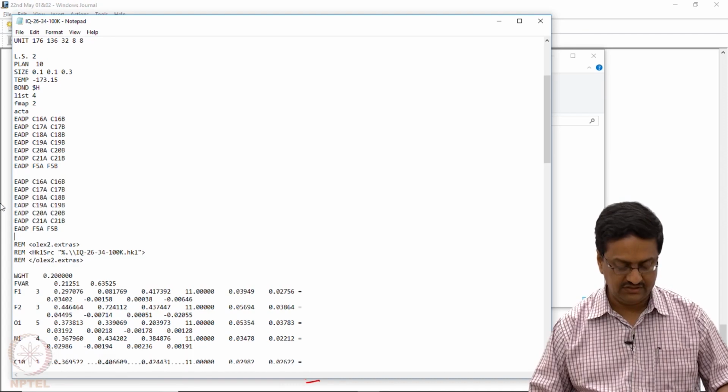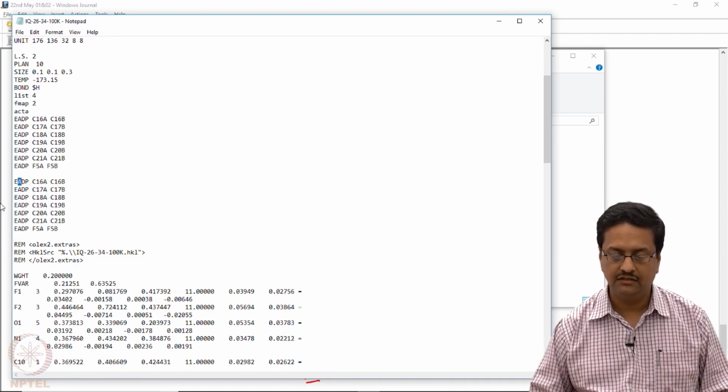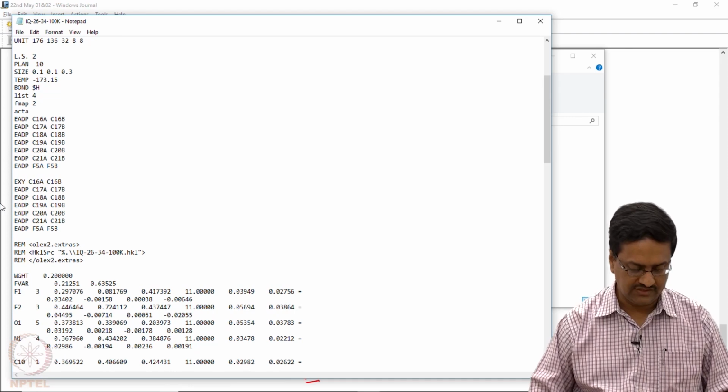So copy and paste it here and change the ADP to XYZ.